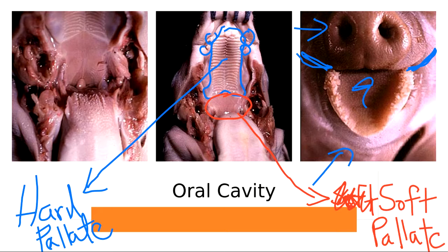Okay. All right. Now, at this point the students would say, "Okay, we looked at the mouth," and I would say, "You haven't cut deep enough yet." And they look at me like I have two heads on top of my original head, and I say, "Yeah, I'm sorry, but you do have to keep cutting because you want to take a look at the epiglottis."